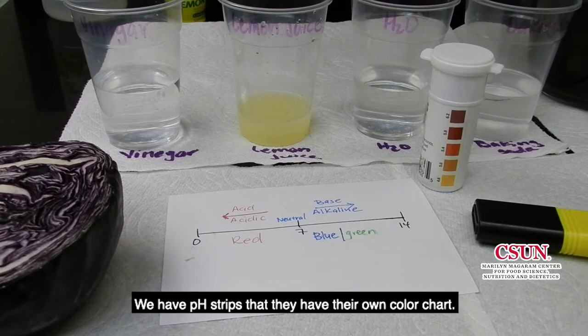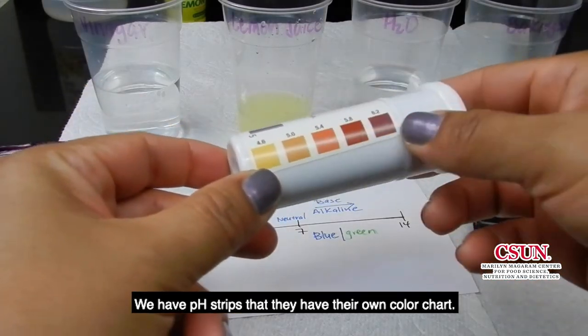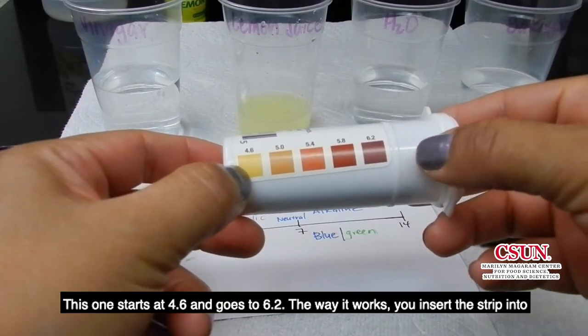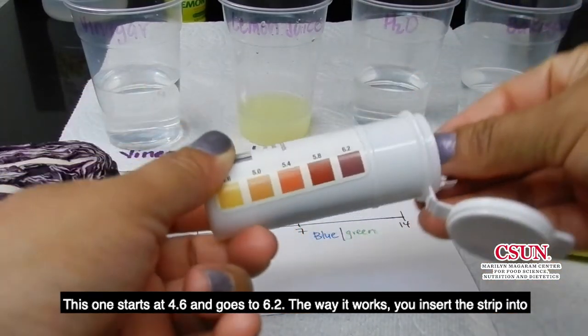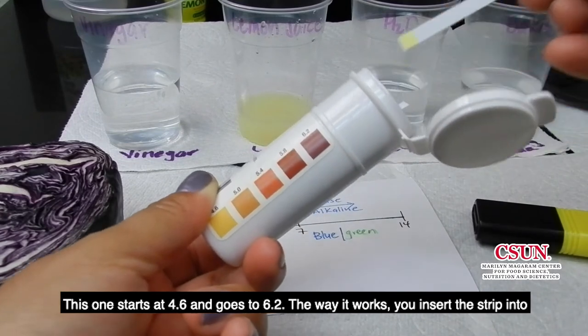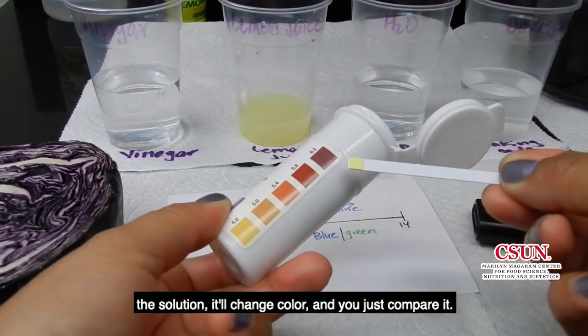We have pH strips that have their own color chart. This one starts at 4.6 and goes to 6.2. The way it works, you insert the strip into the solution, it changes color and you just compare it.